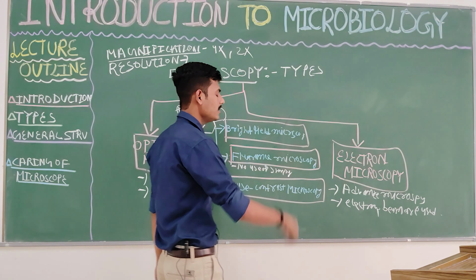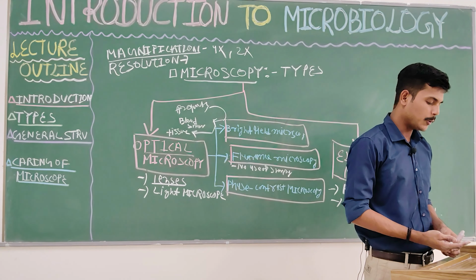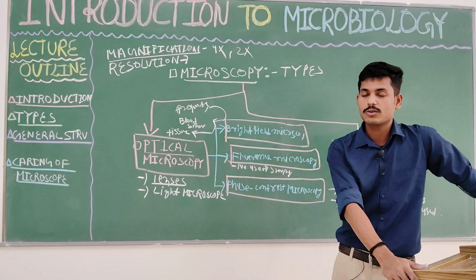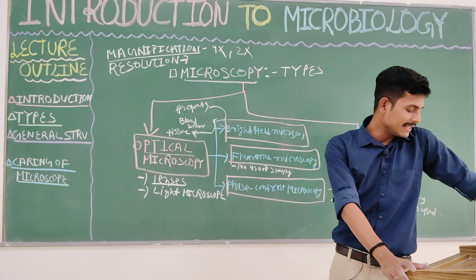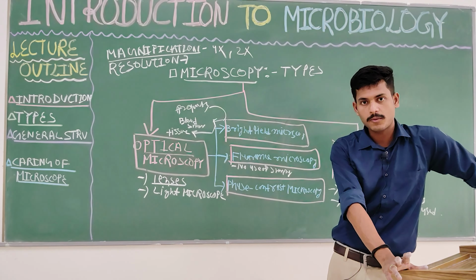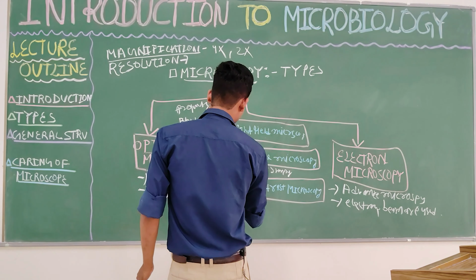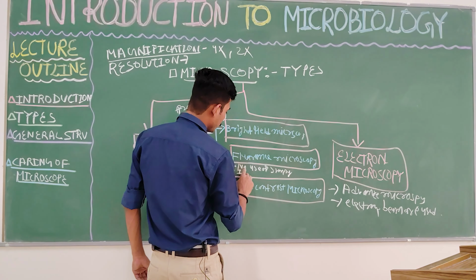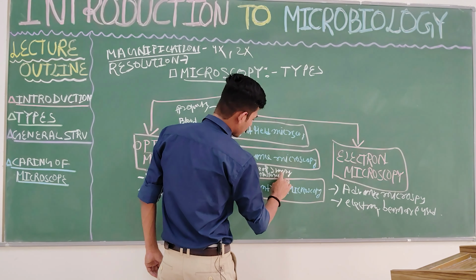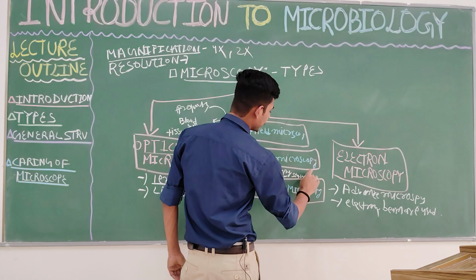This is commonly utilized for immunofluorescence studies to detect specific antigens in the tissue, and it is also used with fluorescence-labeled antibodies. So you should write down the example: it is used in the study of immunofluorescence, of antibody and antigen.